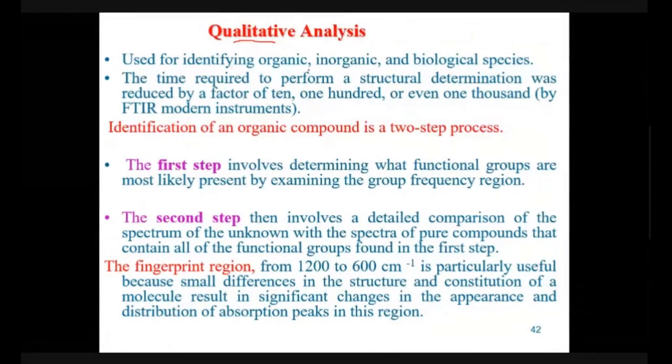Use of identifying organic and inorganic biological species. The time required to perform a structural determination was reduced by a factor of 10, 100 or even 1000 by the modern FTIR instrument. You don't have to change your wavelengths. All the wavelengths are bombarded simultaneously.